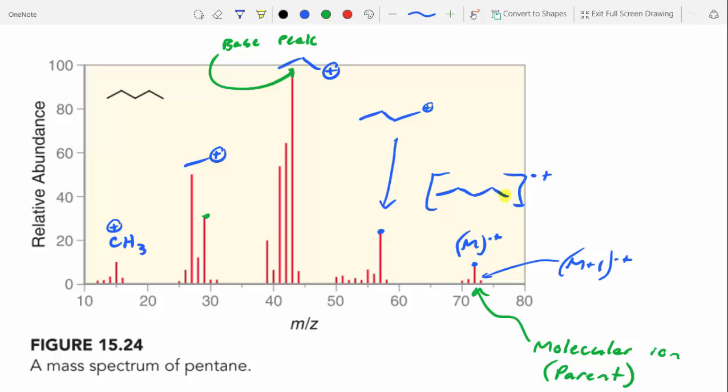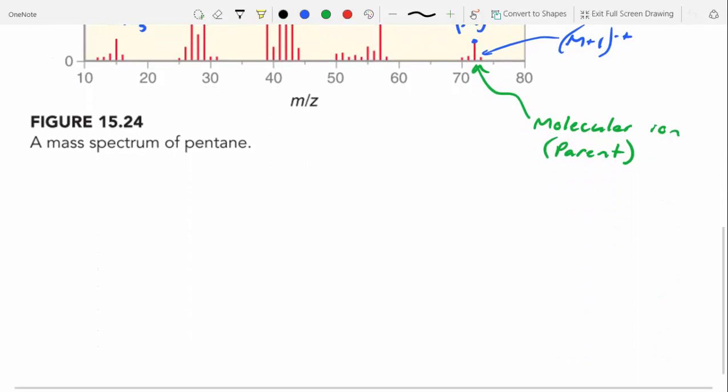And then we said that you get these clusters of peaks that are kind of sporadically placed throughout the rest of your spectrum, and those are your mass fragments that usually correspond to some sort of functional group getting chopped off, whether that's a methyl group, ethyl group, propyl group, or so on. And this is really useful, but let's talk about a couple useful tricks in mass spec, because right now we're only looking at hydrocarbons. There's one really useful trick that has to do with nitrogen.